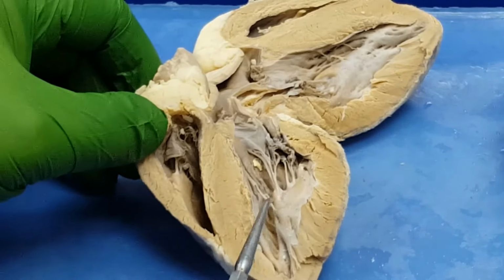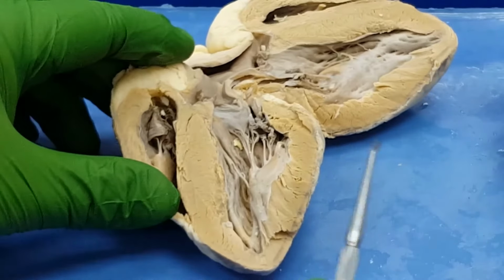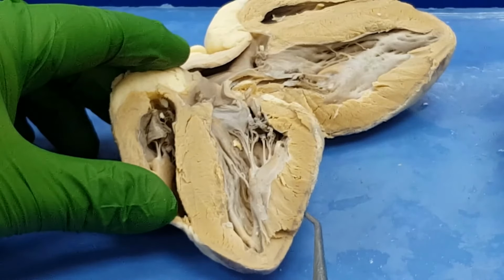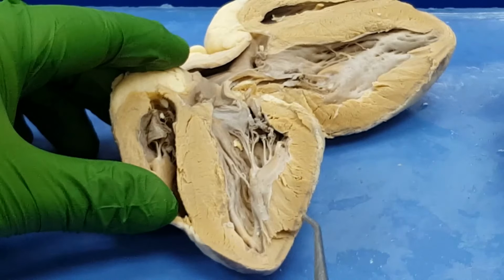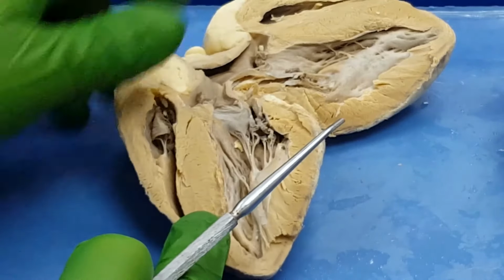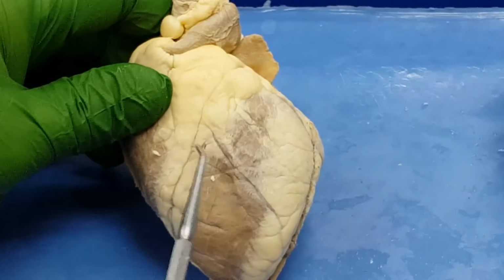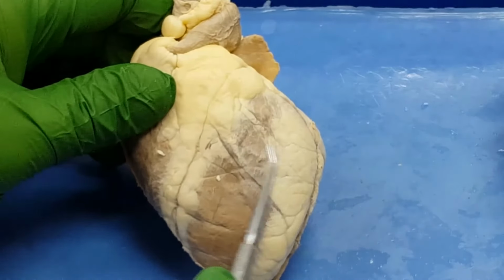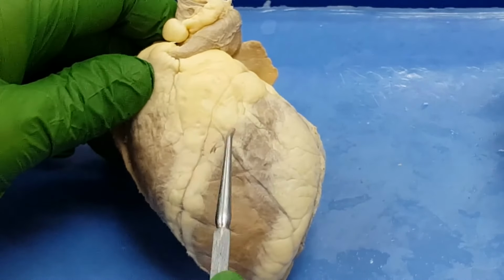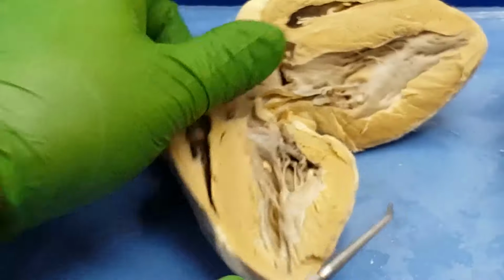So if we start looking at a few things that we can see right here, let's look at the layers of the heart wall. So right here at the tip of my probe, you can see that it's slightly darker here. This is where the epicardium is, holding those coronary blood vessels down, the epicardium or visceral pericardium. If I close the heart back up, I can see the impression of where some of these coronary vessels are, but they haven't been stained for me. They haven't been painted by some model builder. So you're not responsible for identifying them. You can see connective tissue, a little bit of adipose right here. This is just in and under that epicardial layer.